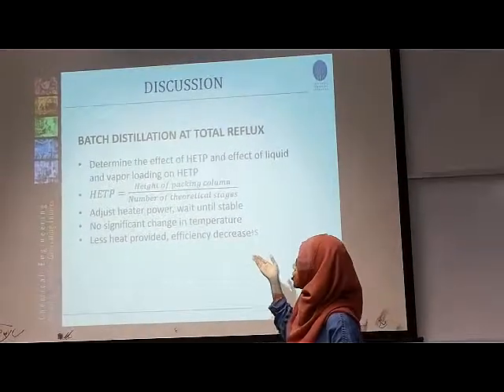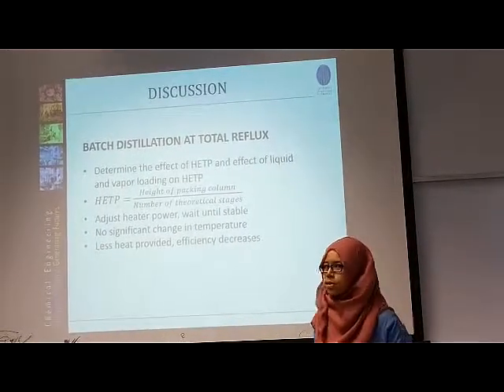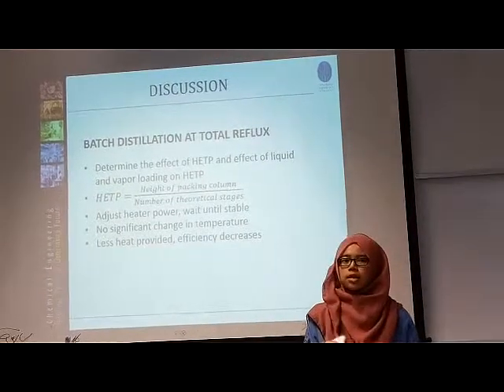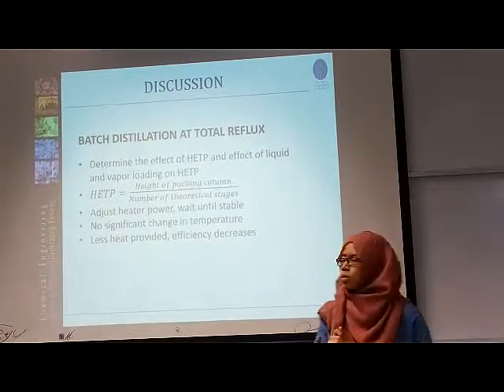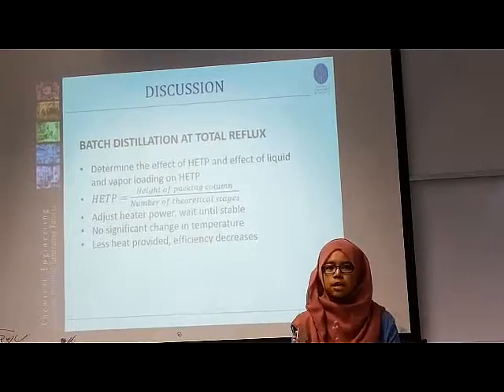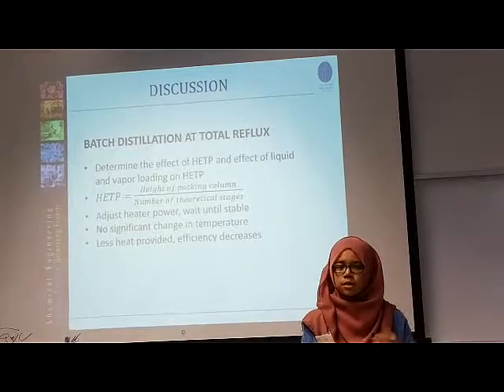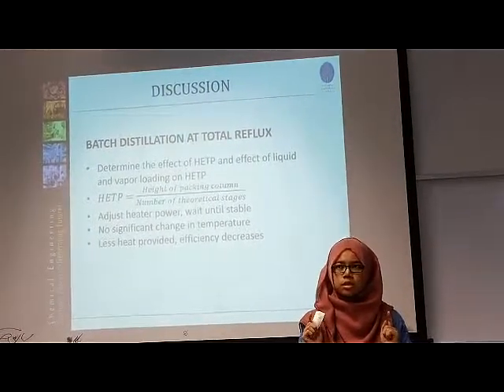So as we adjust the heater power from 100% to 20% in decreasing order, we get that the HETP value will increase. As we increase the power, the HETP value should decrease.